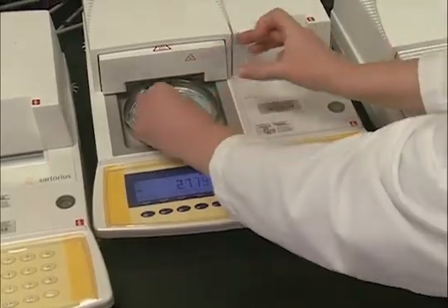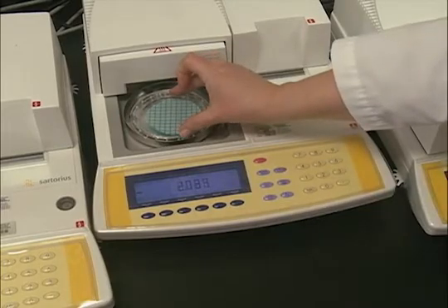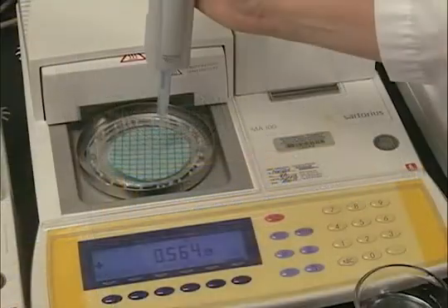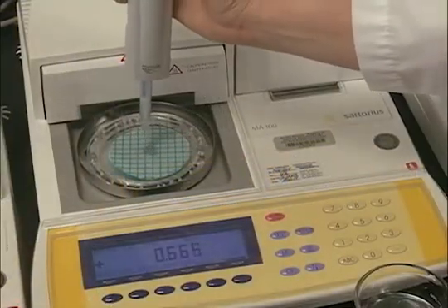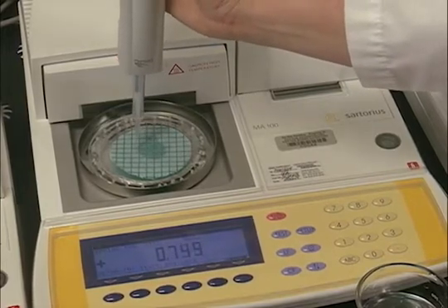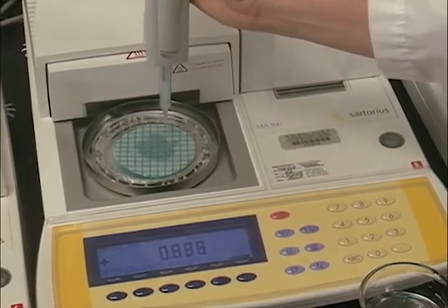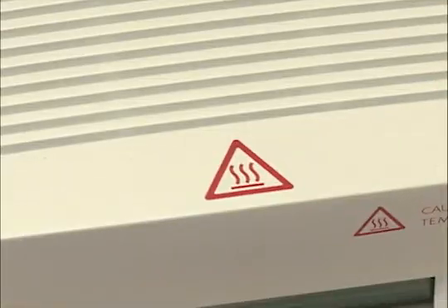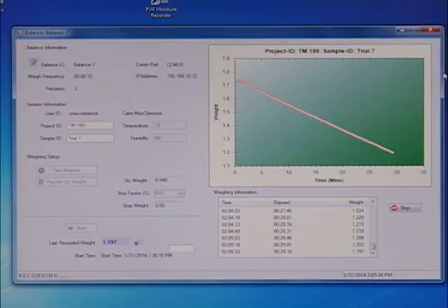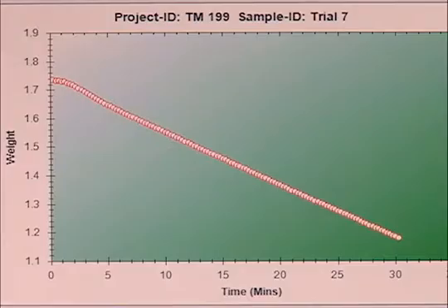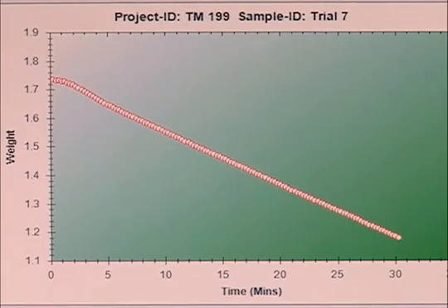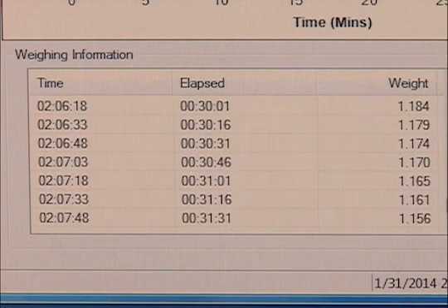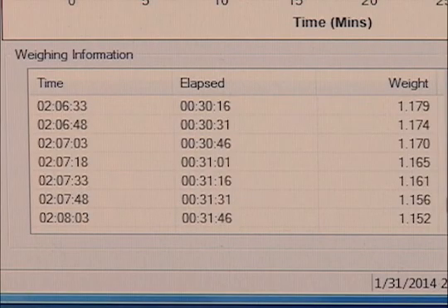Once the tare function has been done, a specimen is placed on the support platform and a circular screen wire is placed on top of the specimen. Then the predetermined volume of distilled water is applied over the entire surface of the specimen. The analyzer, with its analytical software, automatically terminates the test when the selected endpoint is reached. The average drying time in minutes of the specimens is recorded.